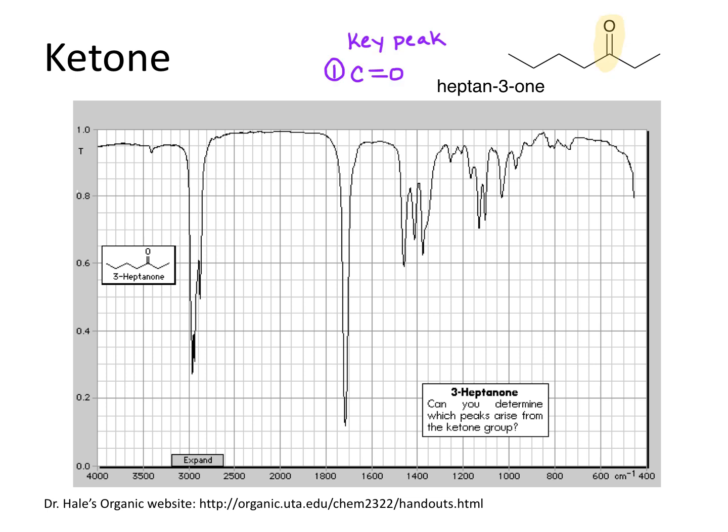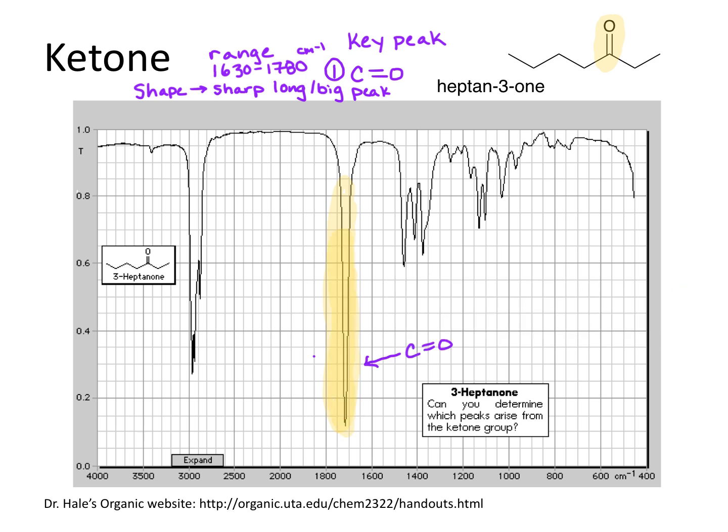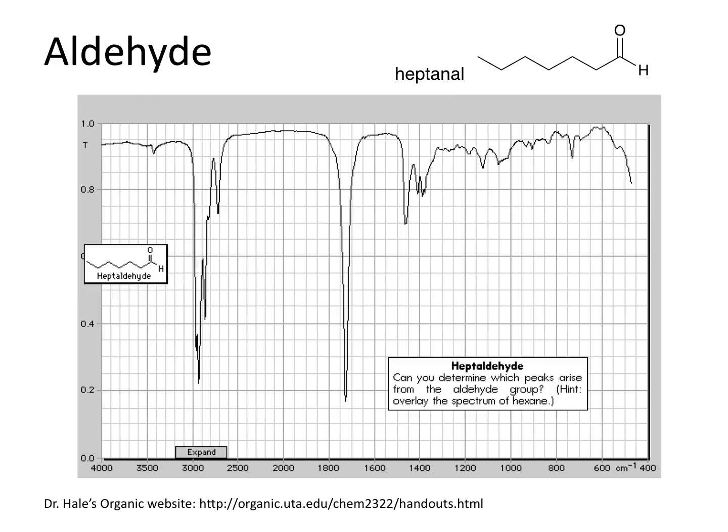Carbonyls are always, if you look at the chart, in the range of around 1700. That's about where they are. They're slightly lower usually, but they could be a little bit higher as well. If you look here, they're a long, sharp peak. You can see right here in the middle, that's where it is, right? That's a long, sharp peak, and that's what you're looking for. If it's not really long compared to all the other peaks, then that's not a carbonyl peak, right? So that means this one's a ketone because it's the only other peak that we see.